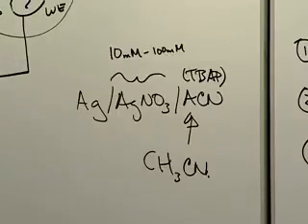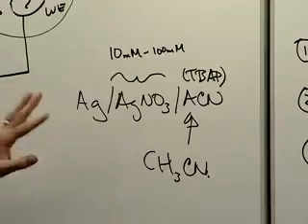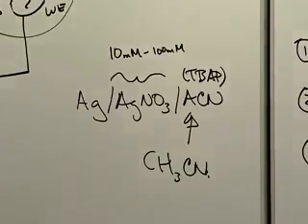So again, if you're going to go and store that electrode on your desktop, you're going to run into trouble because of the lighting around. An electrode like this, if it's well taken care of, will usually last about 3 weeks. And it's a really good idea to recheck the potential of that electrode every so often and make sure it's what you think it is, because if it's a good number on day 1 and 21 days later it's going to be a bad number, there's probably different numbers in between.